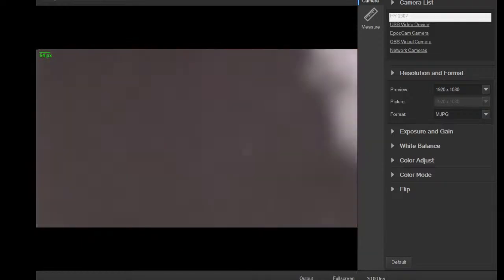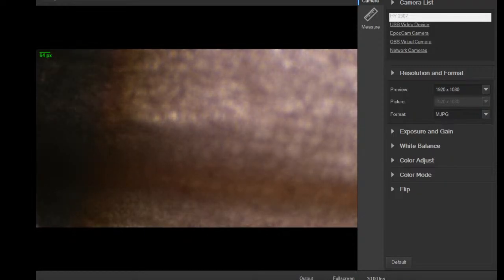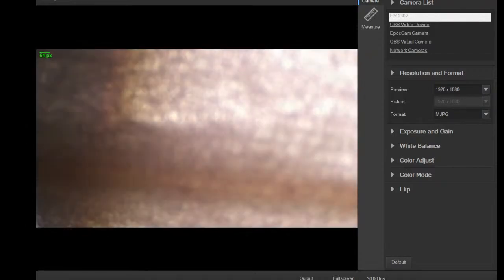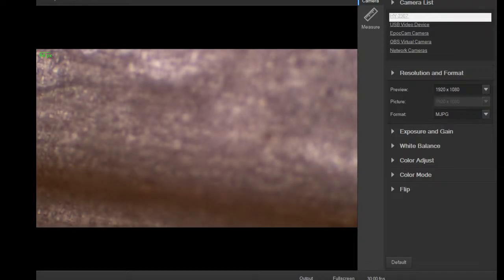See how that looks. You can see the cell structure of the garlic through the dry skin here. This dry mount's not super easy. Let's see if that'll work. All right, what do we got here? Oh, look at that. So I boost the light, and find a good spot to focus on.